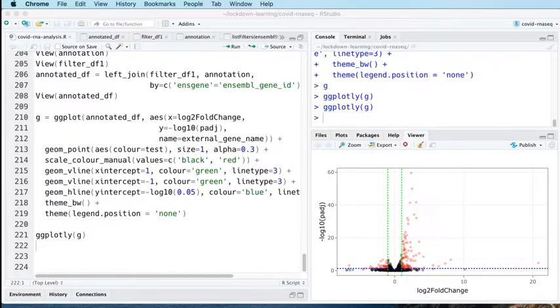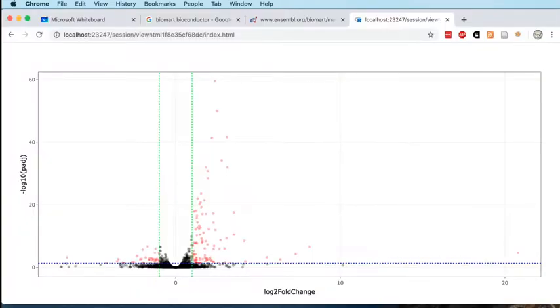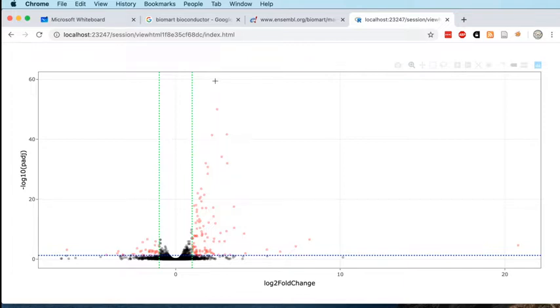I'm just trying to get it in a browser where you can see it. Bear with me one second. There we go. So that's now popped up in Chrome rather than in RStudio. I'll be honest, it doesn't look like it's going to go very much faster in Chrome versus RStudio. I think there's just an awful lot of data that sits underneath this plot, which makes it slightly difficult to work with. That's a little bit better, I guess.